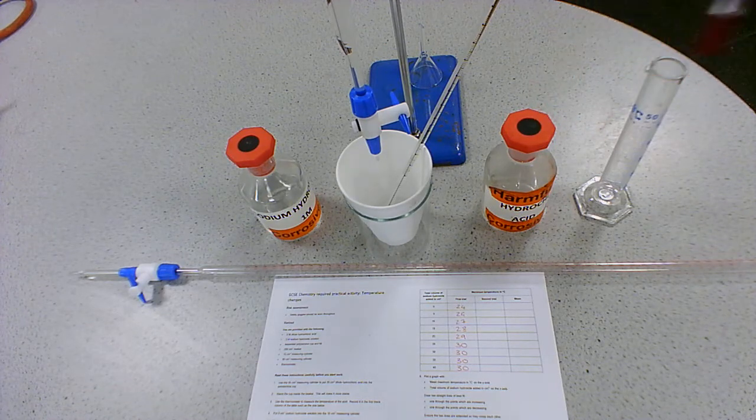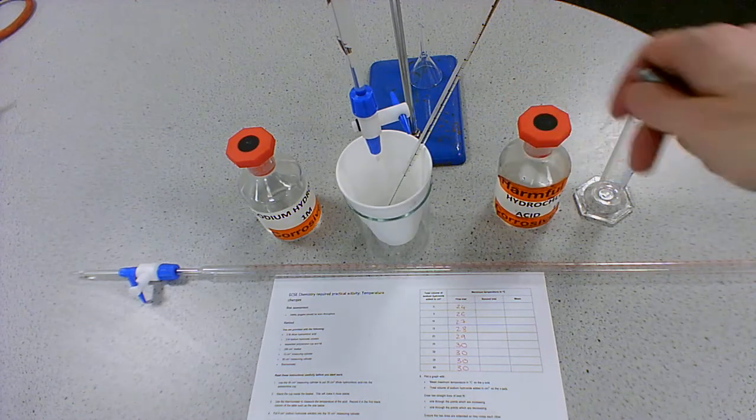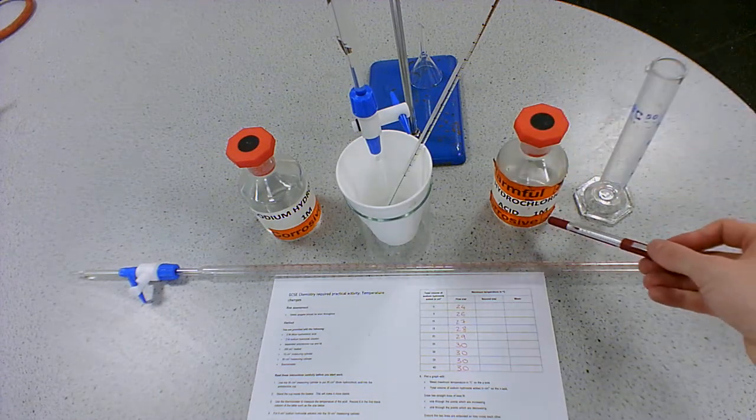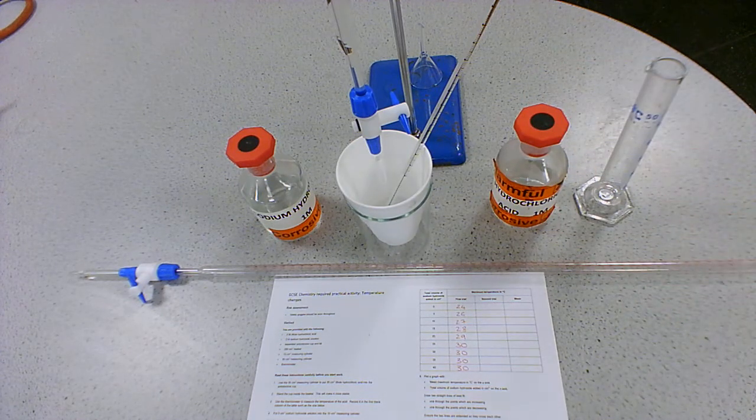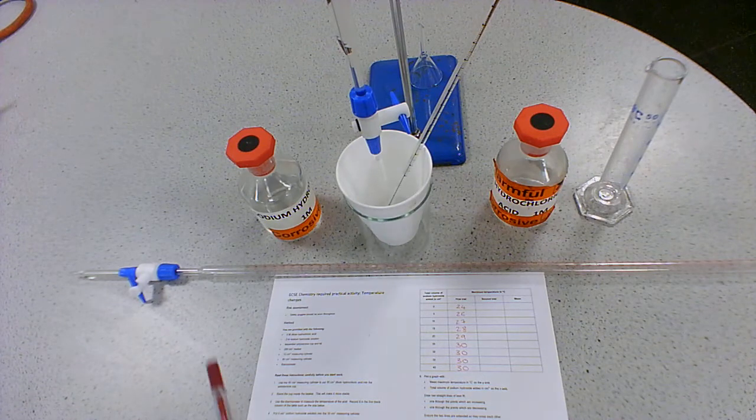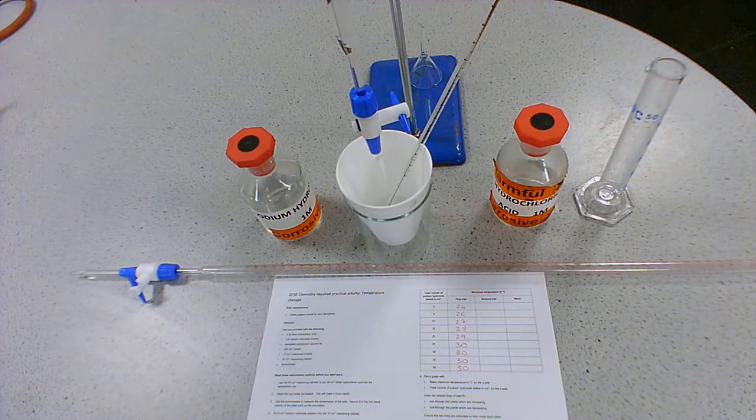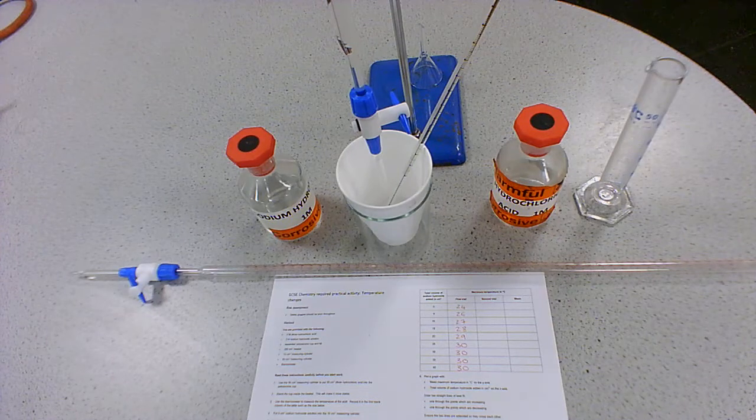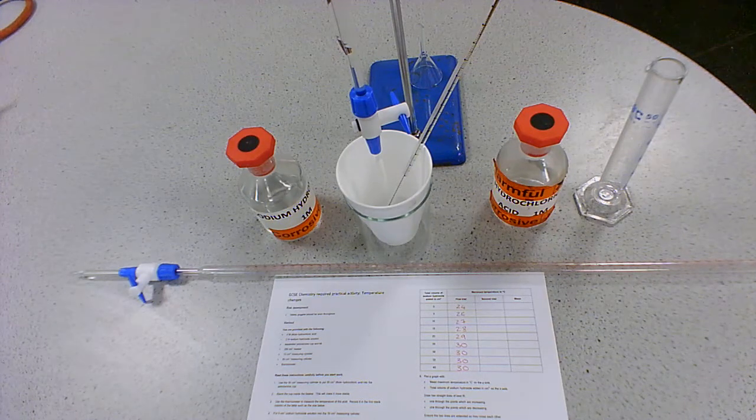So that's our hydrochloric acid measured out using a measuring cylinder so we know exactly how much is in there. And we also know what the concentration is. I'm using one molar hydrochloric acid. And what we're going to do is add sodium hydroxide. We're going to add it bit by bit. Measure the temperature change after each addition. And then we're going to plot a graph. And I'll explain that all in a minute.